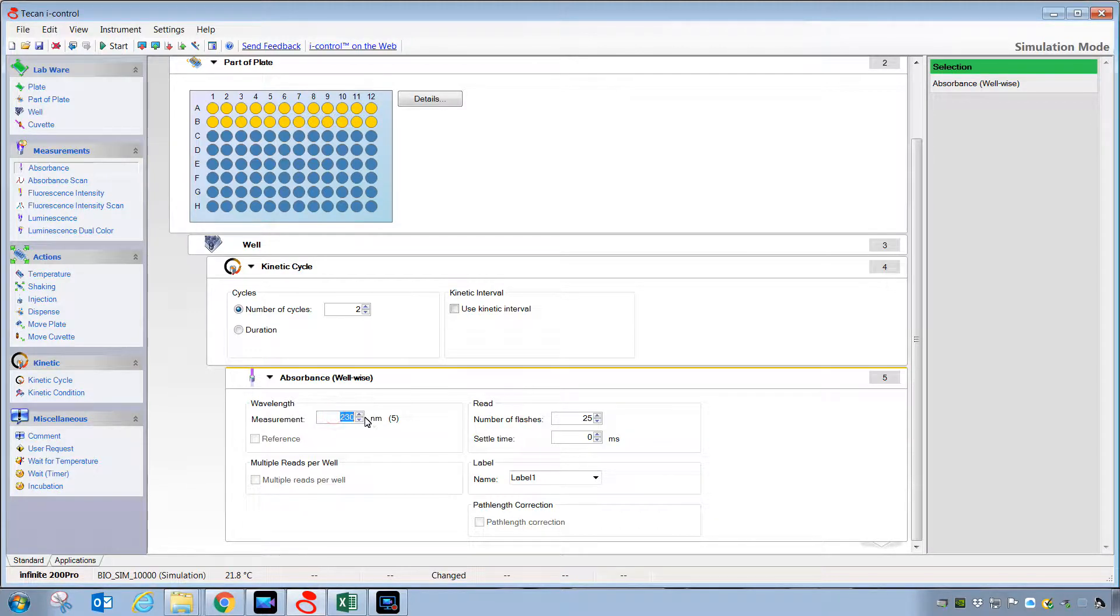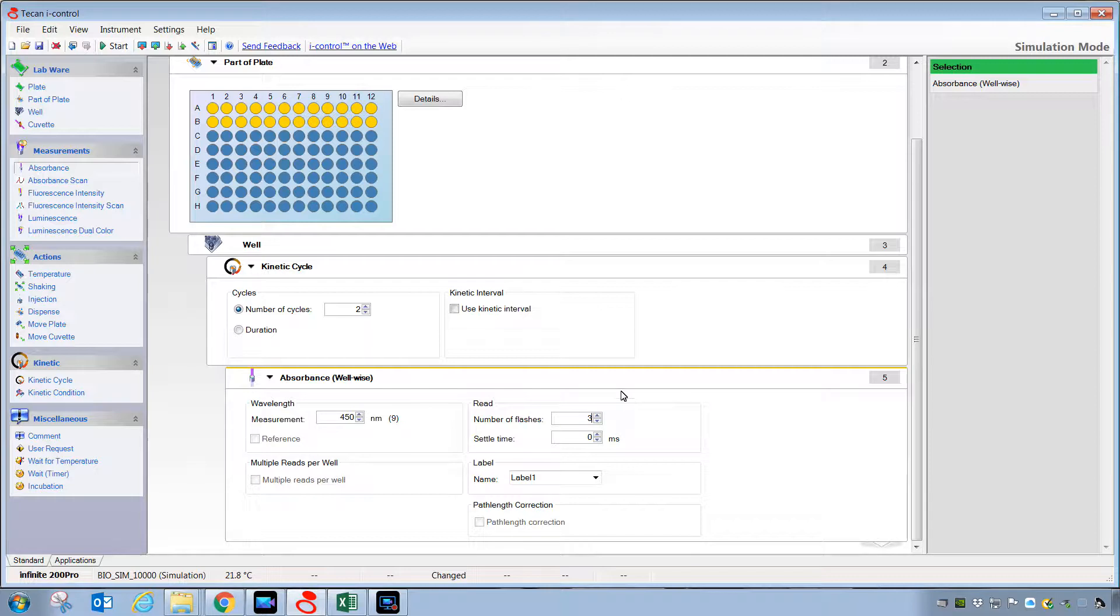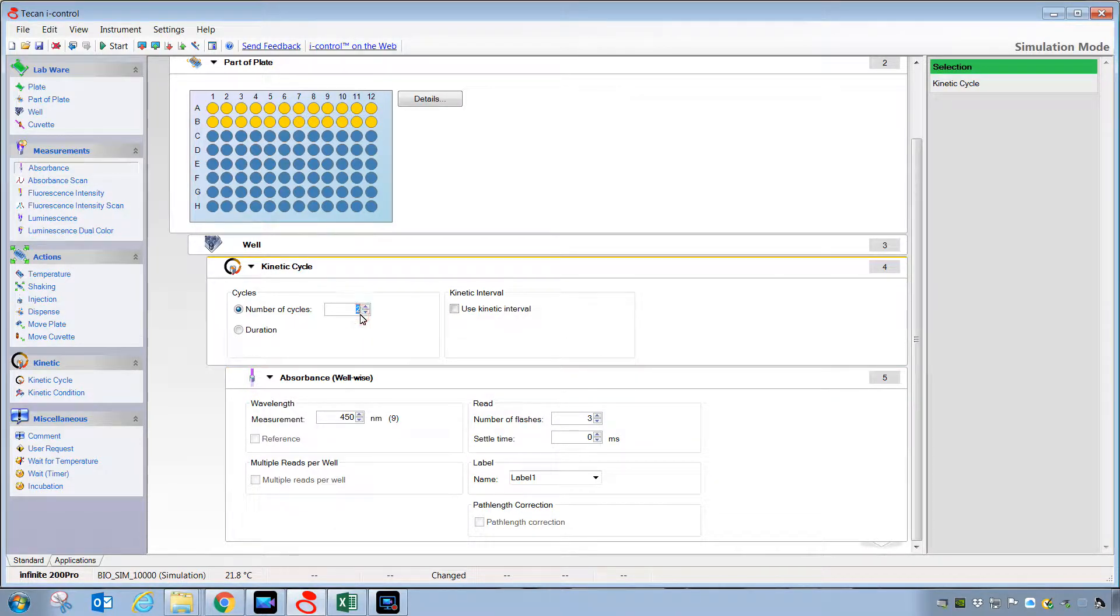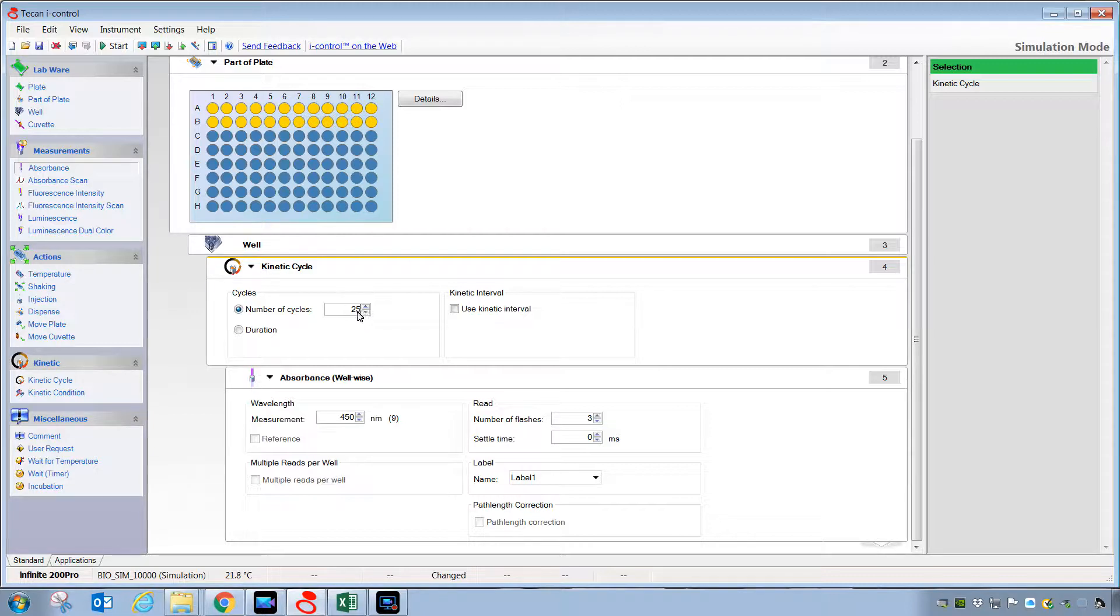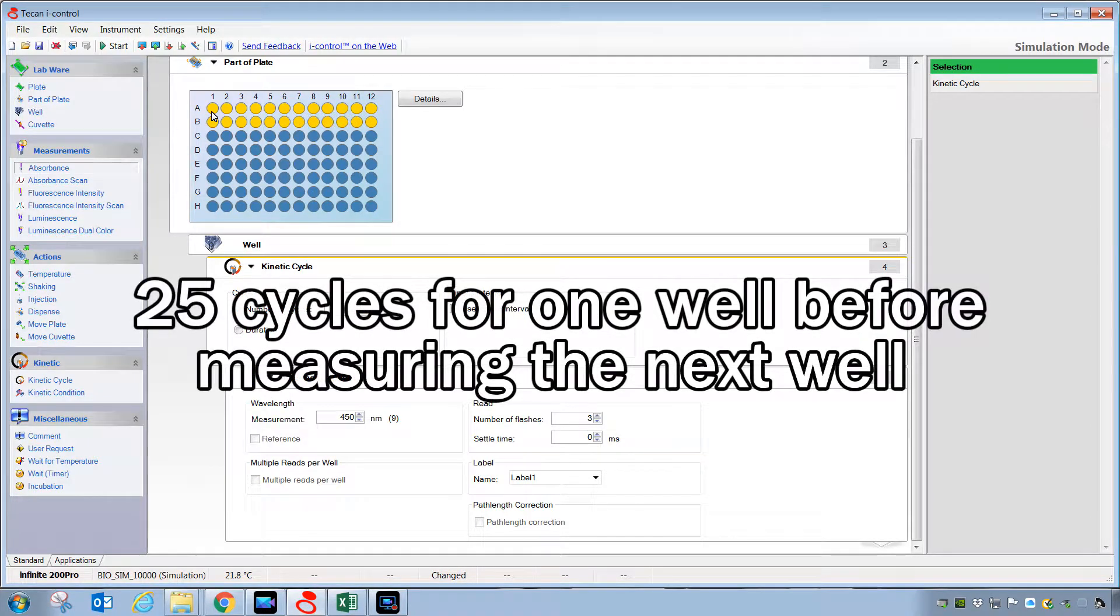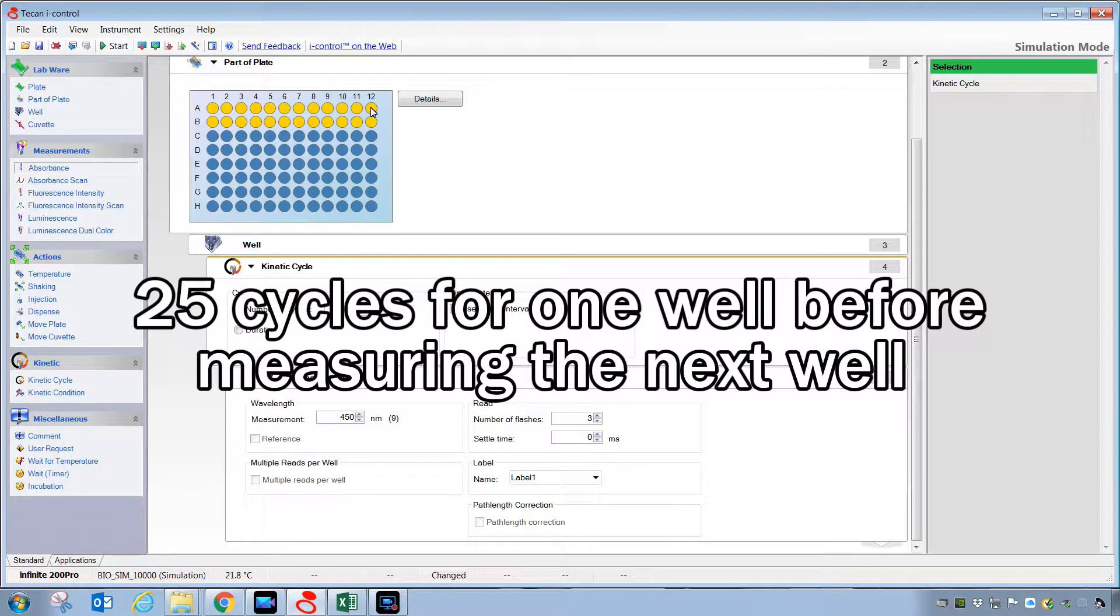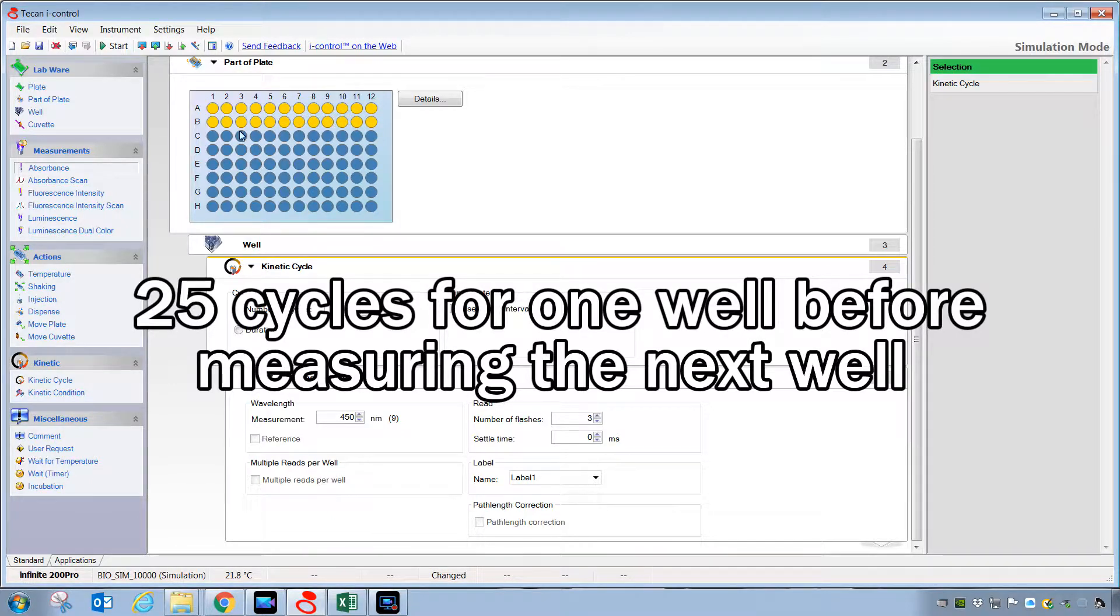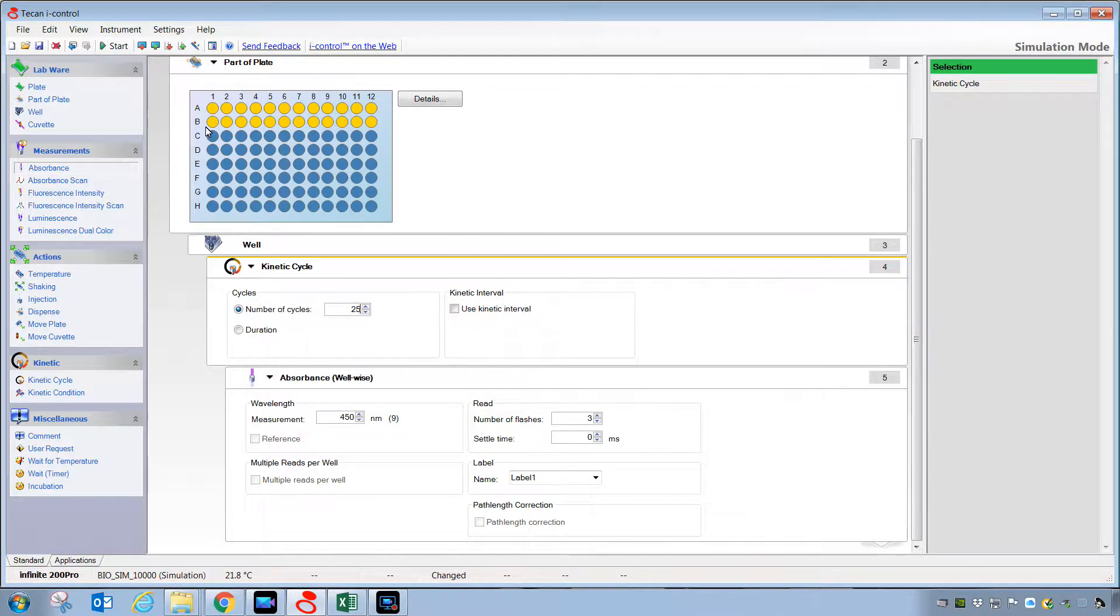We'll type in some settings like 450 and three flashes. We're also going to add some additional cycles here of 25. If executed right now, this kinetic script would begin by measuring 25 readings at 450 on well A1 and then progress out across the plate. It would then drop down and measure B12 and then sweep back across to B1. We would get individual kinetic curves for each of the wells.